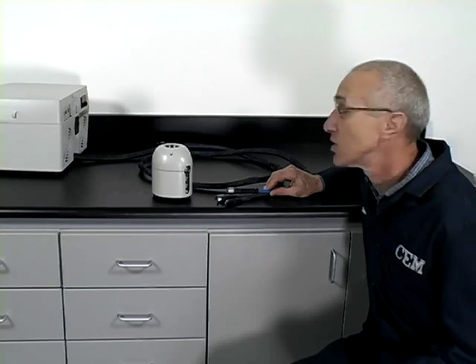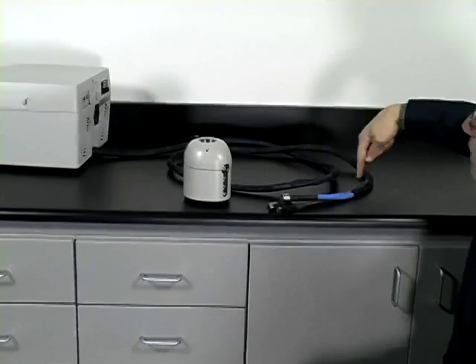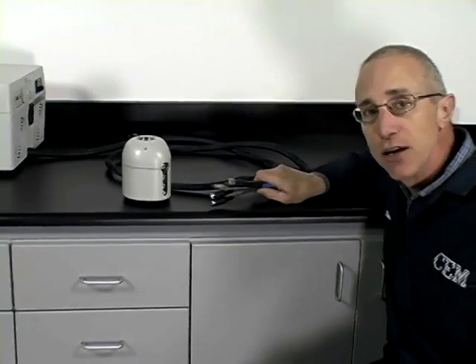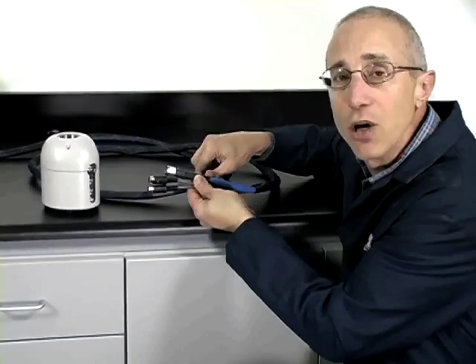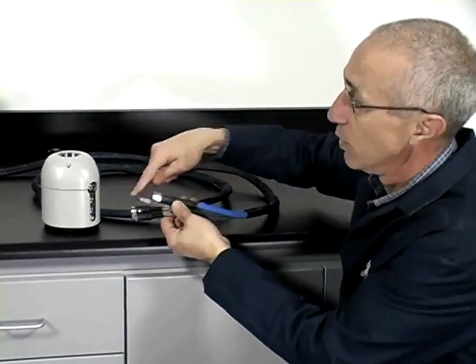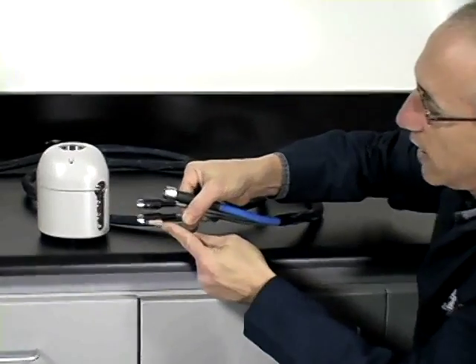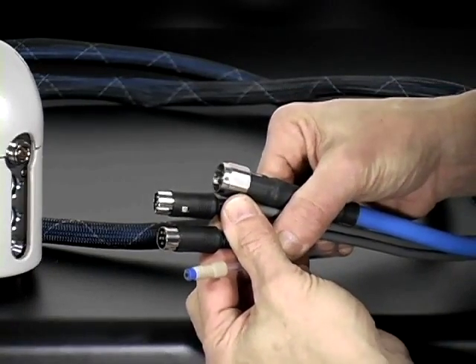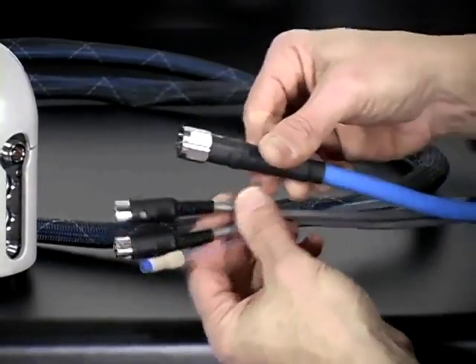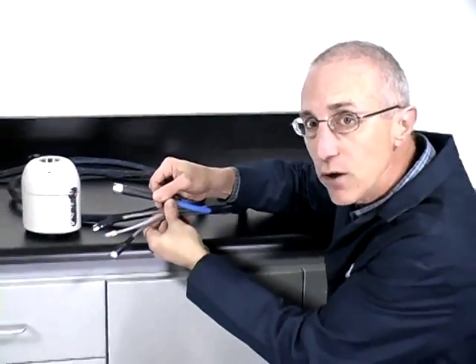The cable bundle connects the controller to the remote microwave applicator. You can see it coming out of the back of the controller, and it's approximately ten feet in length, or a little over three meters. In real life, you would run the cable connection through the wall of your hot cell or glove box and connect it to your remote microwave applicator. In the bundle there are four connectors and a gas line. The gas line uses a PEEK connector. The two middle connectors are pin connectors: an eight-pin connector for the mag stirring feature and a six-pin connector for the temperature feature. The last one is a blue screw connector used for the microwave transmission cable — that's how the microwave energy is put into the cavity.